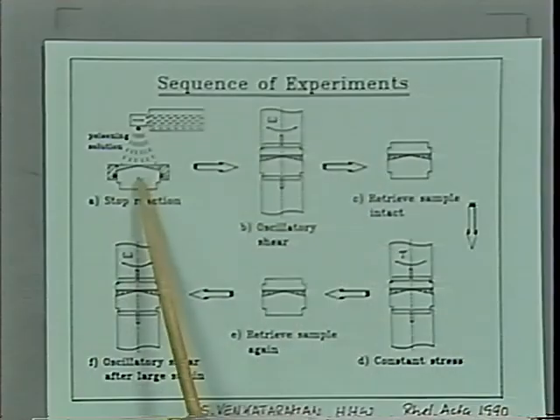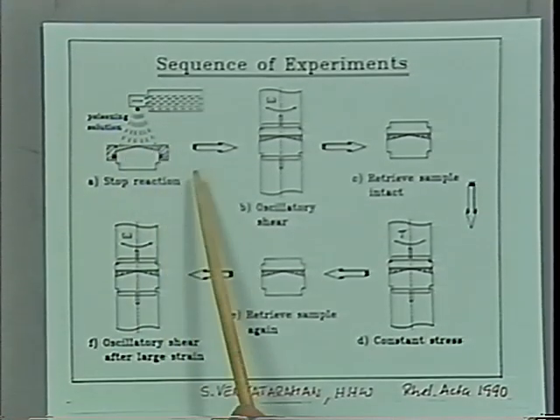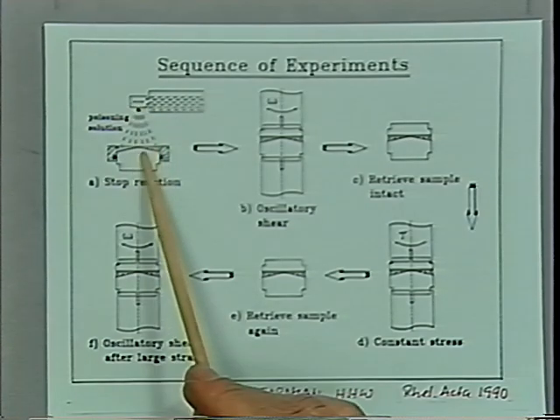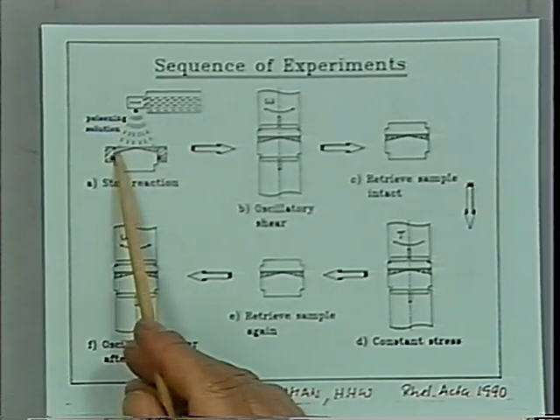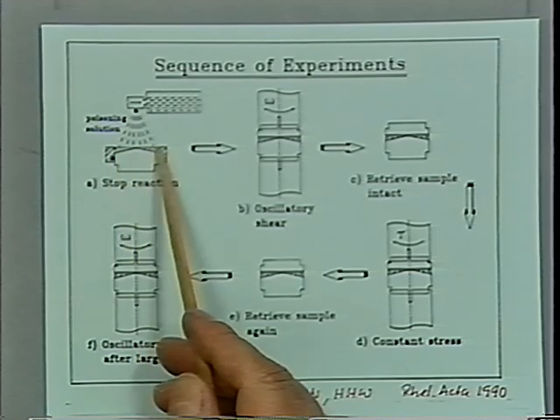Here he would produce a small sample on a cone and plate, have the system reacting for some time, and then poison the catalyst. By diffusion, the system will be filled with that catalyst poison. All the catalysts there will be poisoned very quickly.